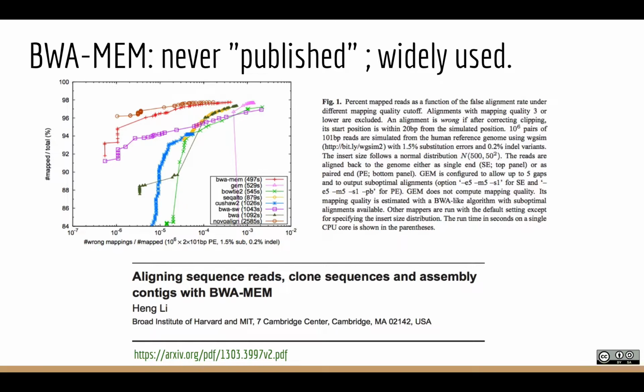And so in summary, what this is showing, BWA-MEM is this red line, and it's second best. The shape of this curve is second best to this aligner called Novoalign that I used a lot during my postdoc. It's just really slow and it's commercial. So what BWA-MEM is showing is that it got kind of similar performance to Novoalign in 497 seconds versus Novoalign took maybe 5 times that time. Novoalign is a really good aligner, but it's actually fairly expensive, so BWA-MEM has sort of taken over.